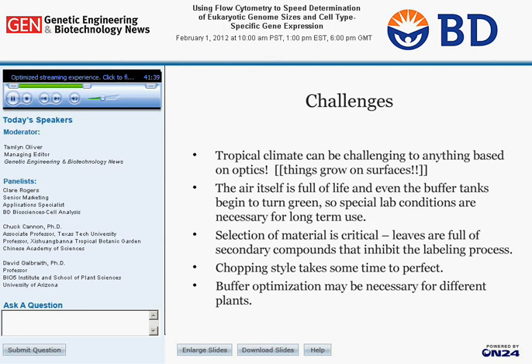So some of the challenges that we do face, just to mention some of these, is that in the tropics, it's a very wet, humid climate, very warm, and there are many living things everywhere. There's a lot of things in the air. So anytime you're studying using optics, it can be difficult. I remember studying primates, and I had binoculars, and my binoculars would grow fungus after a few months. And so anytime you're doing something like this for long term, and so we keep the machine there for over a year now, and things begin to grow on the surfaces, and so you have to be extra careful to try to keep the machine dry, and so you really need to keep it in some kind of special lab conditions.